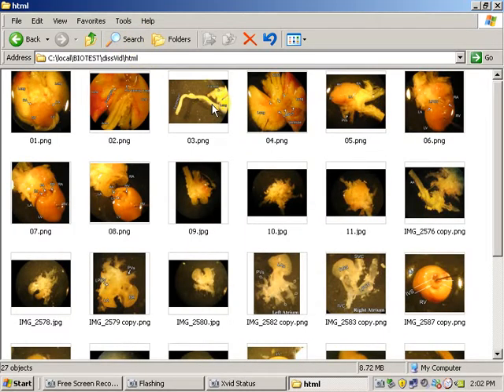Okay, I'm going to demonstrate how we can quickly convert a large collection of images from one file format to another.